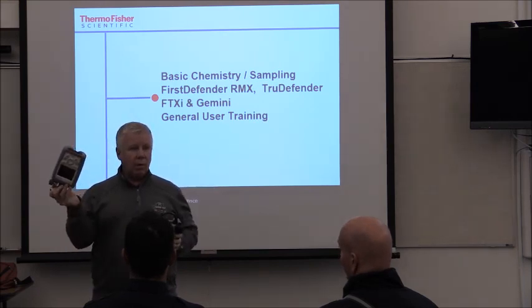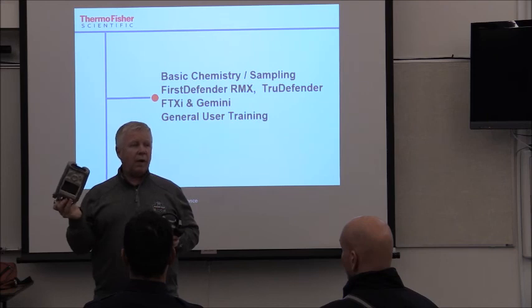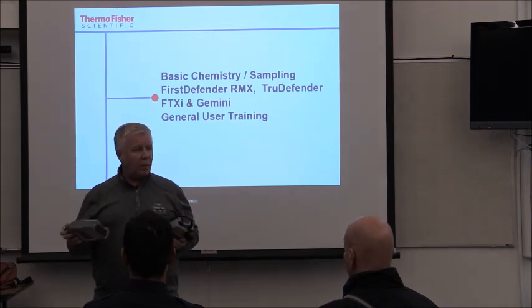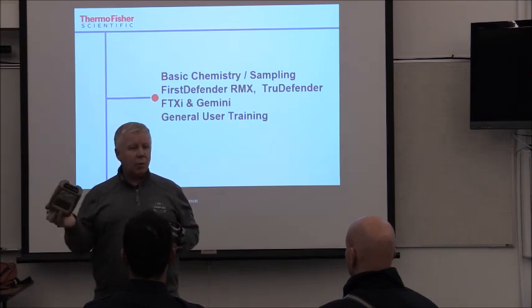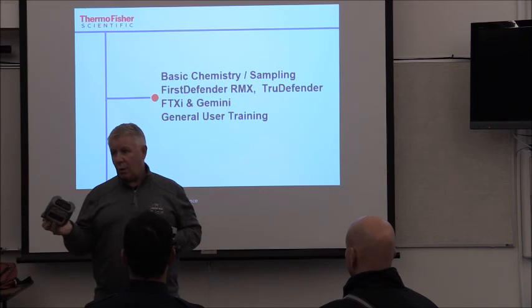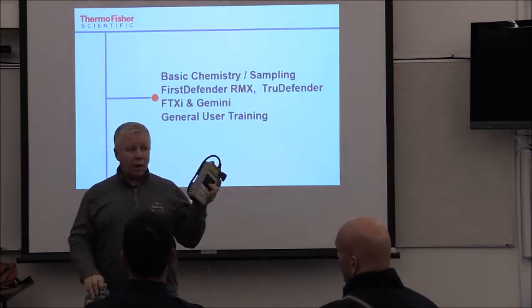This will see water. Now, let's say it's hydrogen peroxide in water. This will see the water, and if the concentration of the peroxide is fairly high, at 6% or something like that, it may see both of them. But if it's low, 2% or 3%, it may only see the water. This will never see the water, so it will only see the hydrogen peroxide.